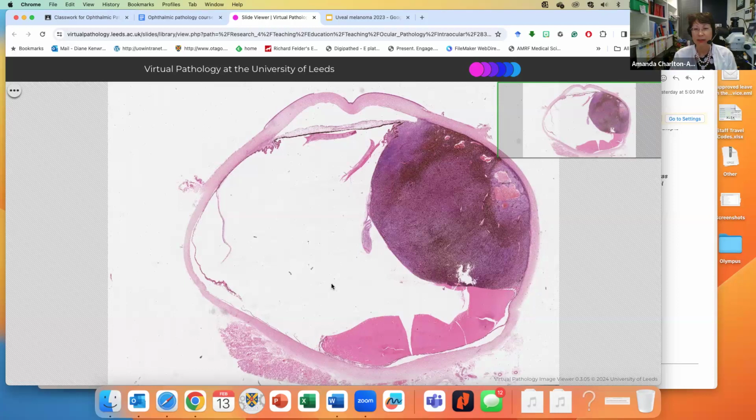How many sections could you get from a globe slice? So they are 2 millimeters thick at least. Lots. So yeah, that means like 60. Yeah, lots and lots. So what you're seeing is just one snapshot of a loaf of bread, one slice in the loaf of bread. There's more slices. Did that answer the PNI question?